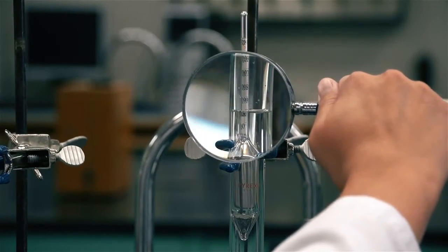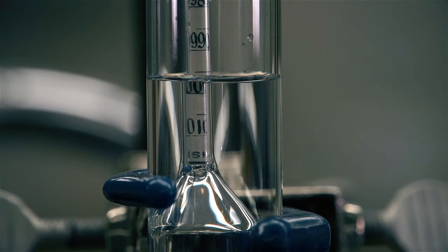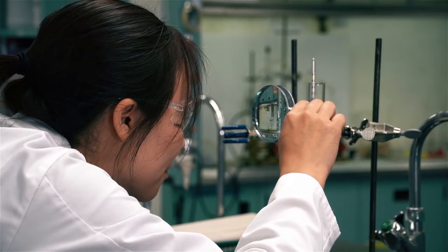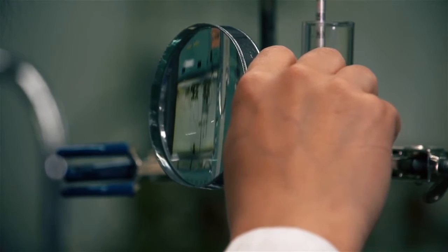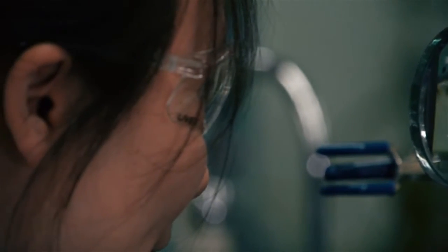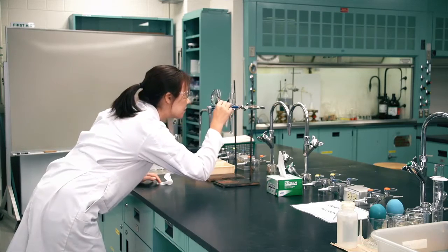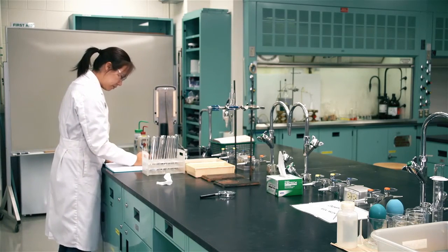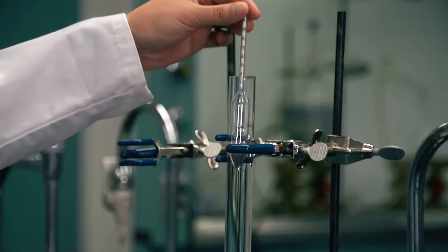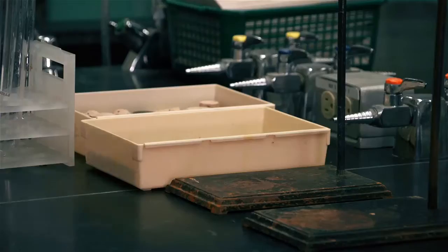0.001 unit. The correct hydrometer reading is that point on the hydrometer scale at which the main surface of the liquid crosses the scale. Determine this point by placing your eye level with the surface of the liquid. Read the scale where the surface of the liquid becomes a straight line crossing the hydrometer scale. Do not read the scale where the meniscus touches the hydrometer. Clean all hydrometers with deionized water, wipe dry, and place in the box.